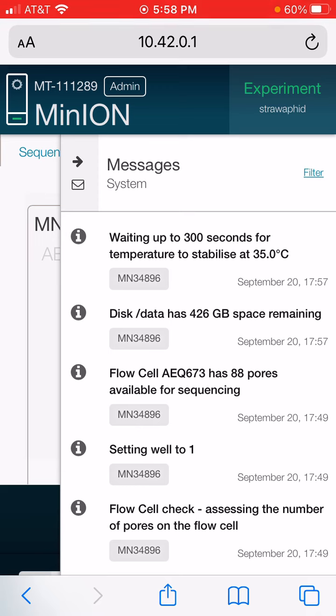That's just a tiny bit below body temperature, which is at 37 degrees. Hopefully that works out. I'm going to pause it now and then show you data if it starts to record here. It usually takes two to five minutes to kick in and start going.